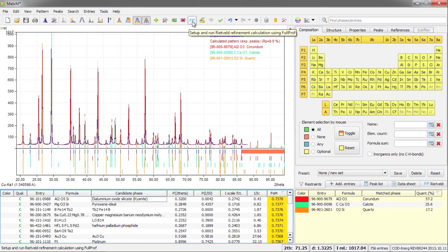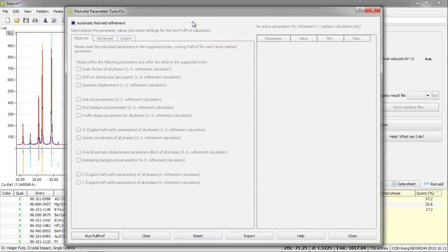In order to do so, I will press this FP button here at the top. And now I will get the Rietveld parameter dialog with the default option automatic Rietveld refinement active.